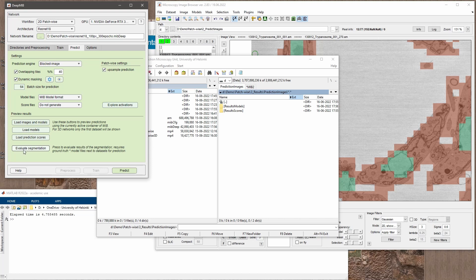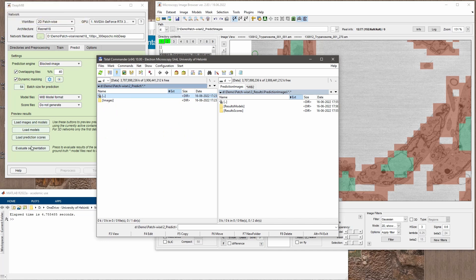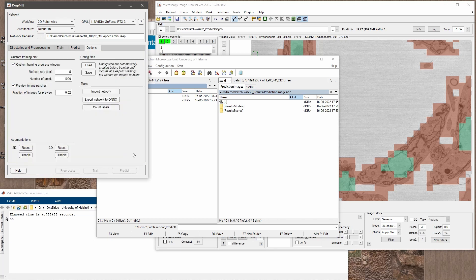We can also evaluate segmentation — if we have labels in the predict folder, we can use 'Evaluate Segmentation' to find out what percentage of the prediction was correct. That's pretty much everything about patchwise segmentation. It's useful for quickly finding out whether you have a particular object in your dataset. Thank you very much for your attention, bye bye.